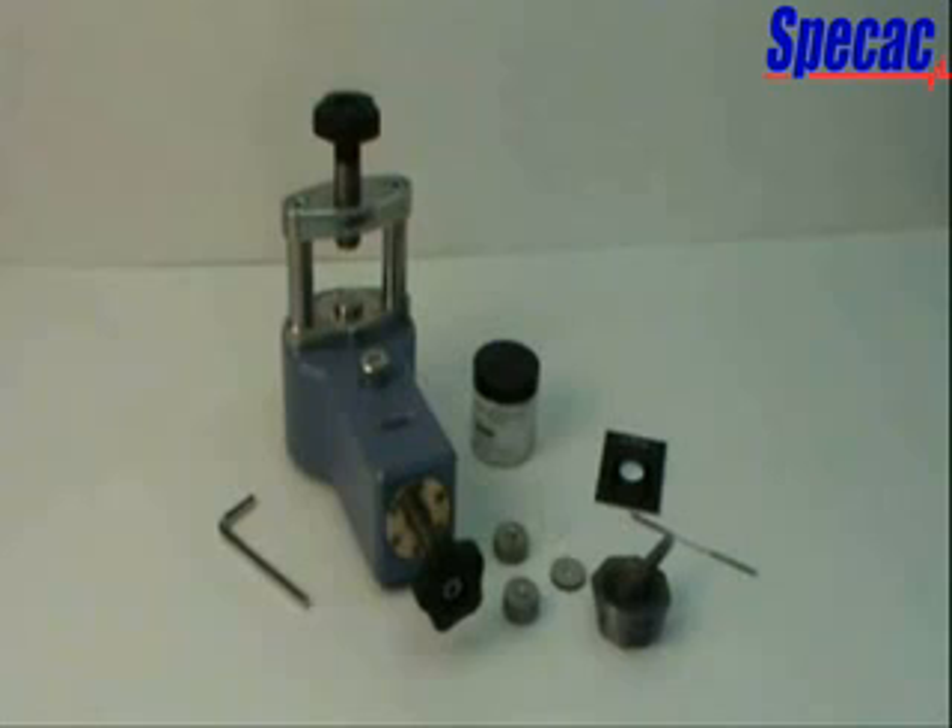The SPECAC Mini Pellet Press, together with its own 7mm pellet die assembly as the basic solid pack, part number GS01150, allows for the production of 7mm diameter KBR pellets for analysis of solid samples by FTIR spectroscopy.